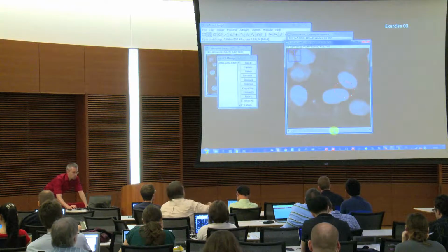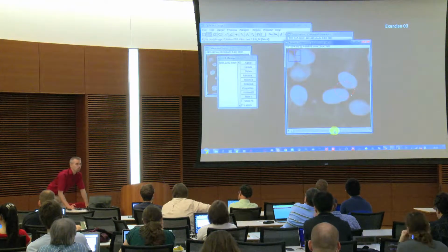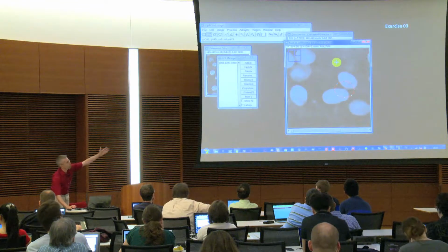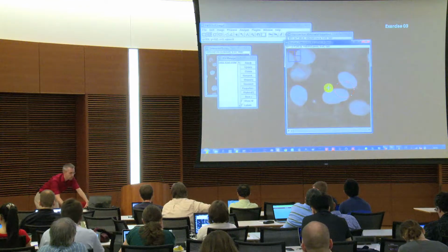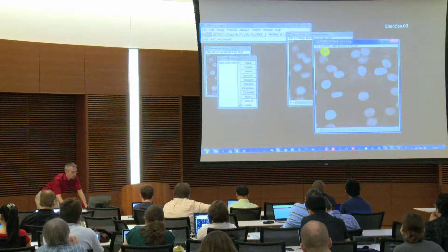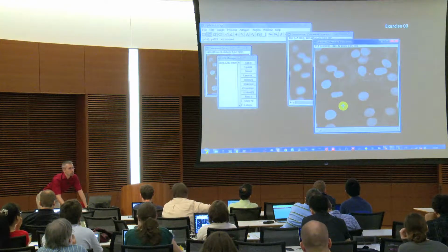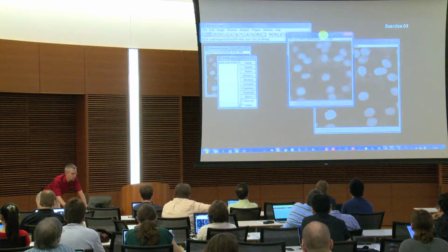We can counteract that later on with the watershed, but this also only works in some conditions, in some others it doesn't work. So if we directly can keep them apart, it's most likely better than later on fixing the problem we created beforehand. So in that case, what we could use for later on would be something around a radius of 5 that eliminates sufficiently the spots and keeps them separated still as good as possible. So that would be an option actually.